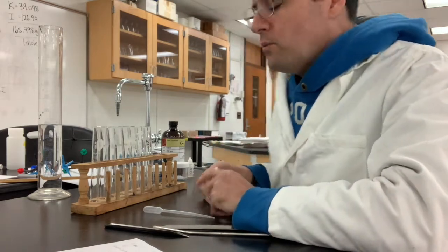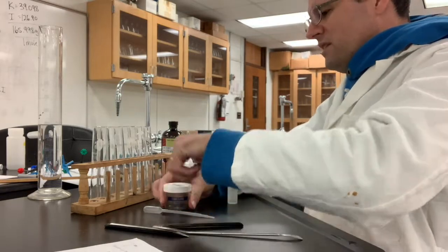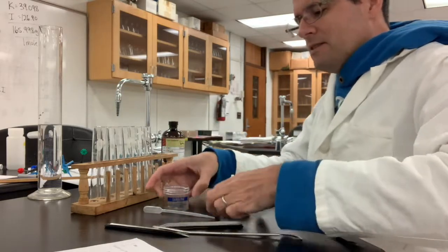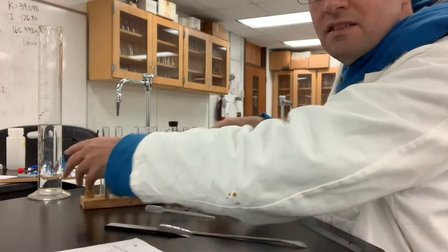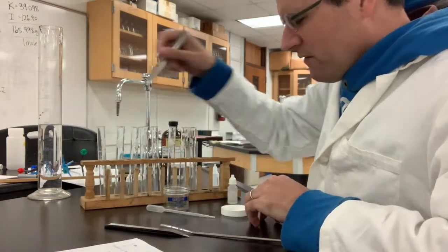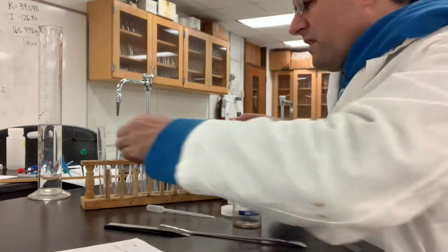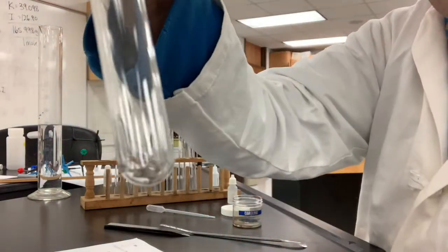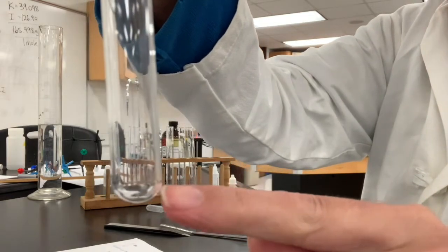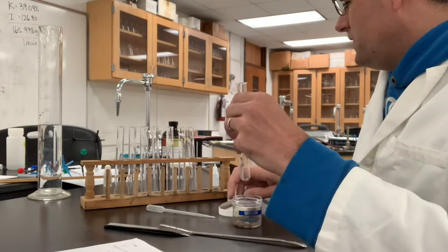Let's do the water tests first. I'm going to take potassium permanganate — you can kind of see this on the test tube on the very left. A little bit of this goes a very long way. You can barely see that little chunk of crystal in there, but you'll see what goes on.